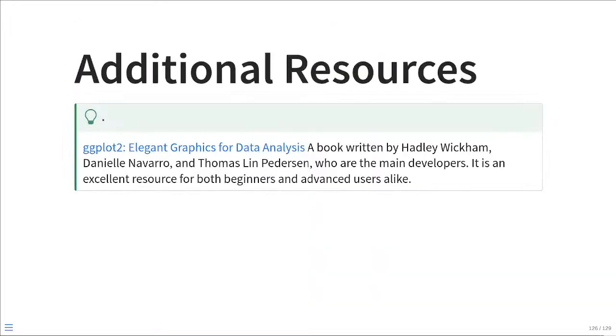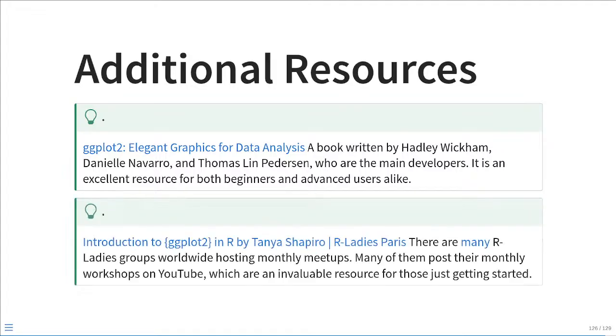Additional resources for today. There's quite a few because ggplot2 is a large package and there's lots and lots of documentation for it. One of the resources I recommend is Elegant Graphics for Data Analysis by Hadley Wickham, Danielle Navarro, and Thomas Lin Pedersen. Many of the authors are actually the ggplot2 maintainers. It is an excellent resource that's good for both beginners and advanced users alike. So if you have a general interest in how ggplot is built, this is the place to go.